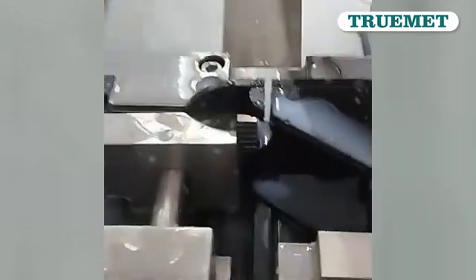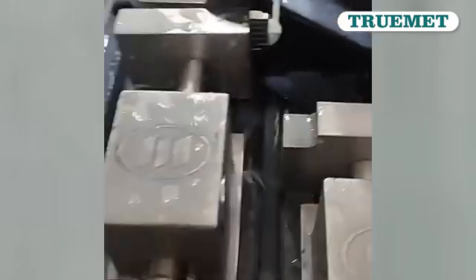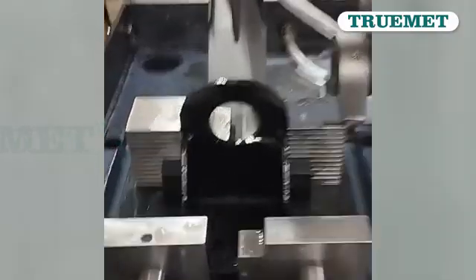So as you can see, the sample has been cut like this. Now going to open it and going to fix like this. So now the sample has been clamped vertically. Going to close the door and start the cutting.